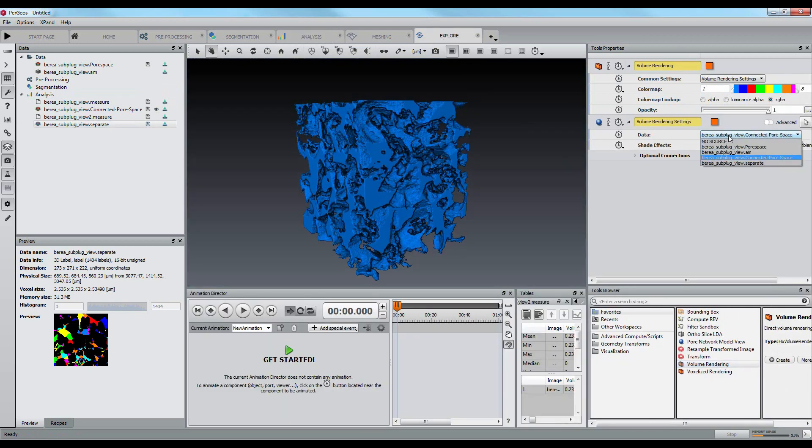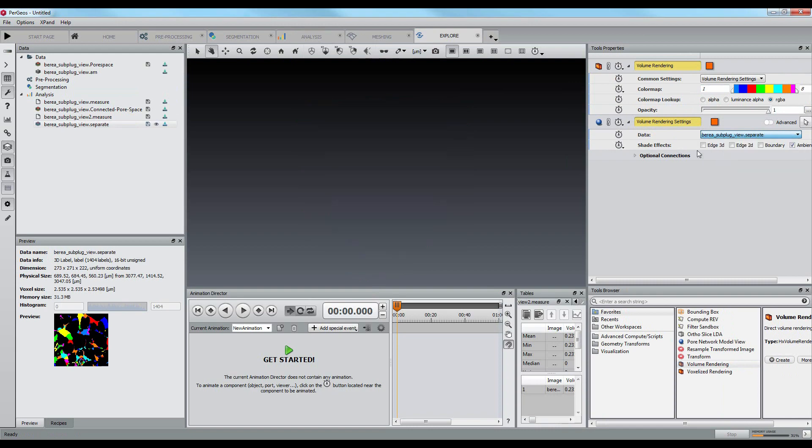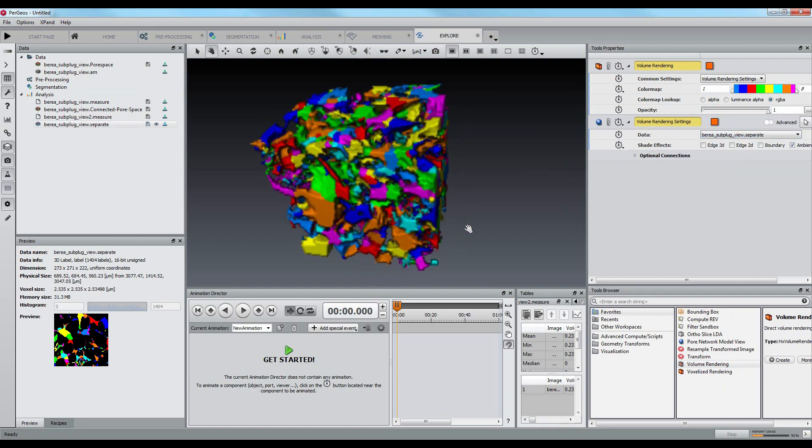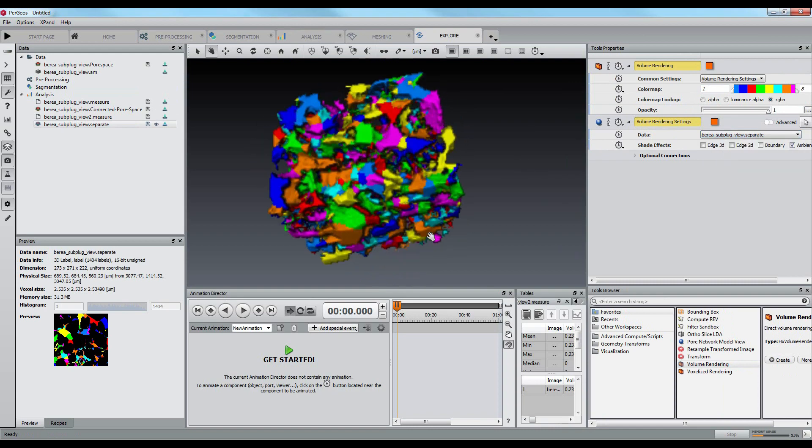Again, we can check a nice 3D rendering by changing the input of the volume rendering.